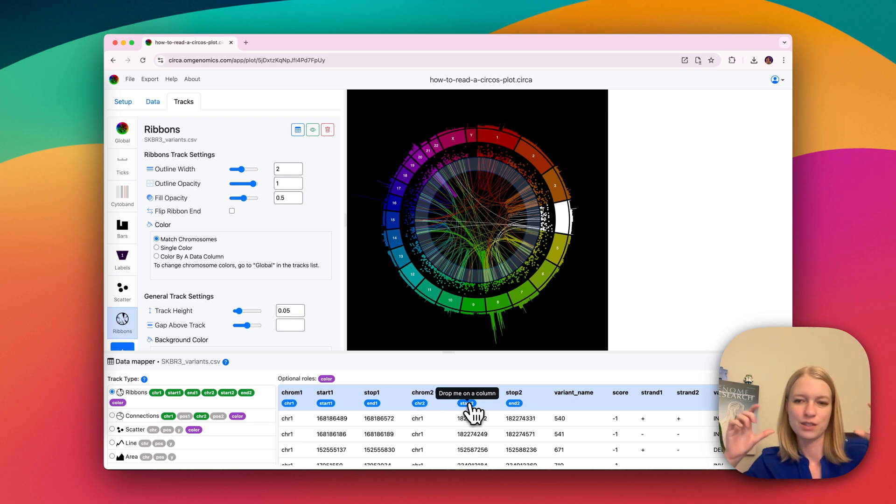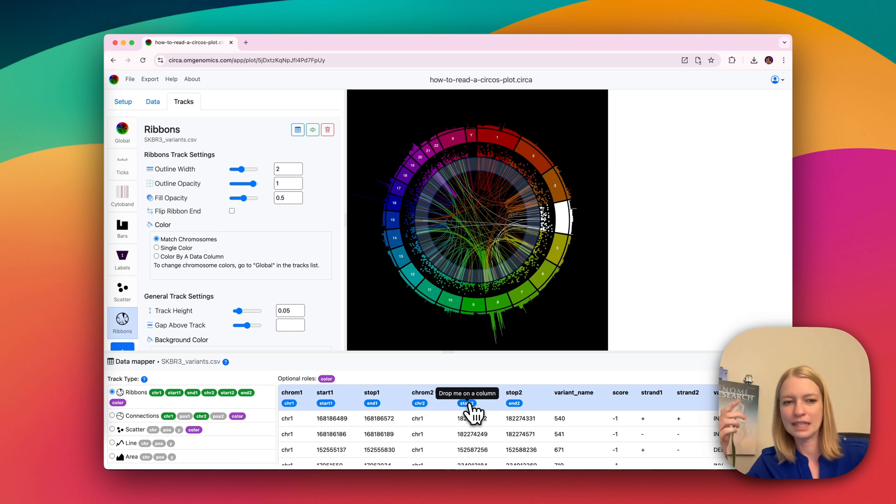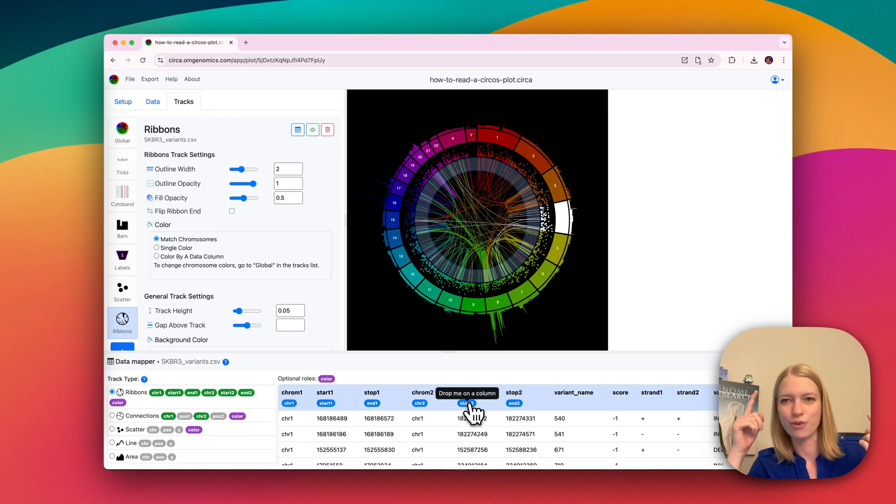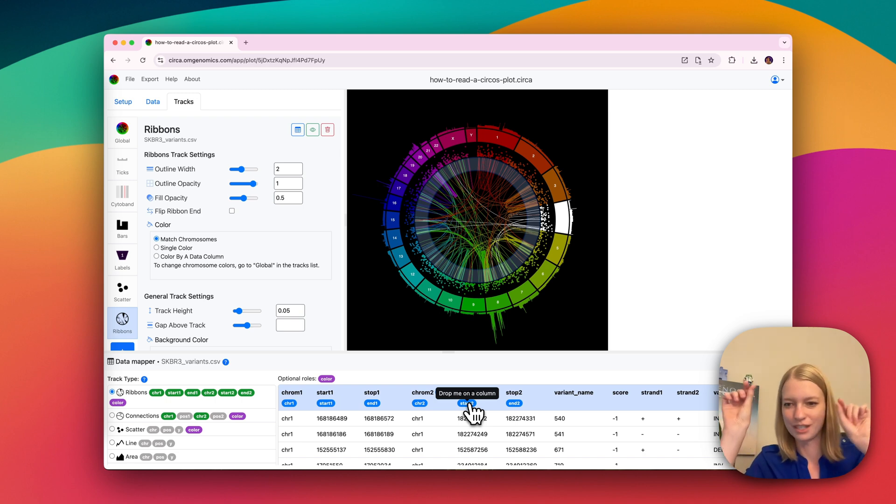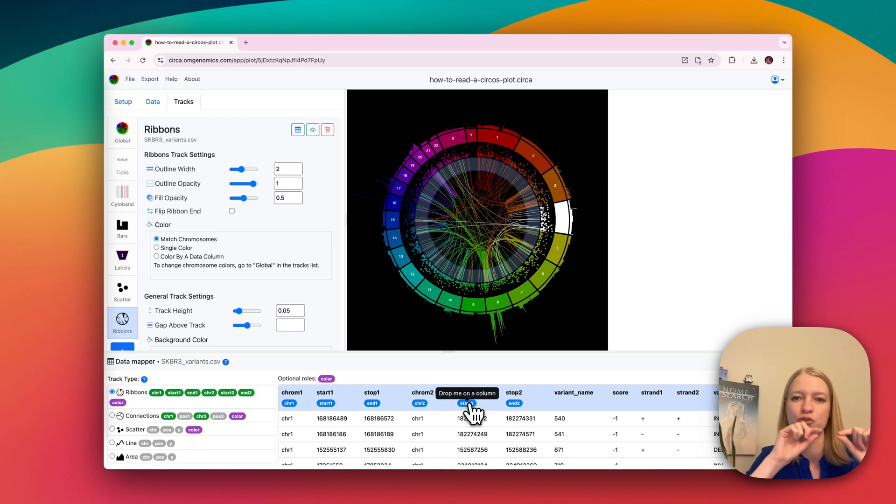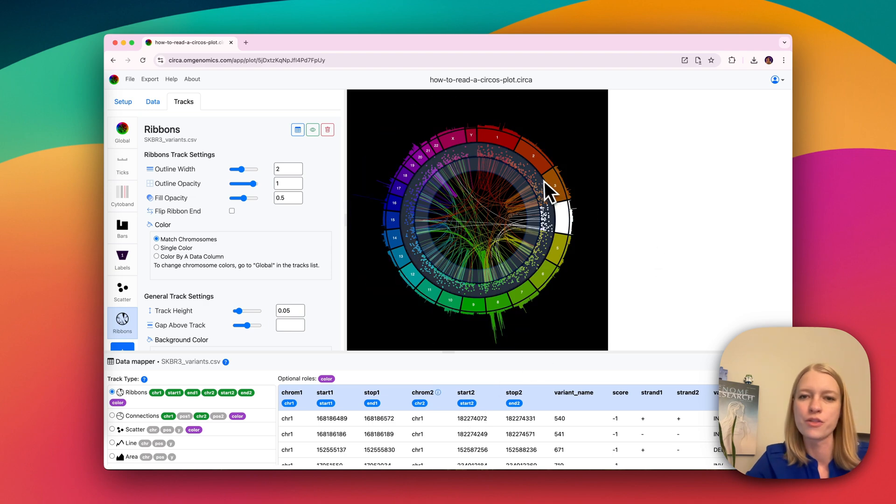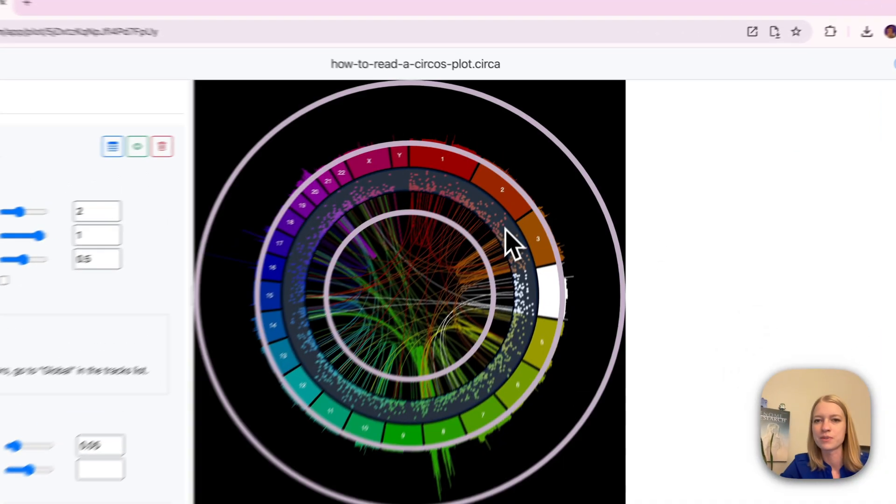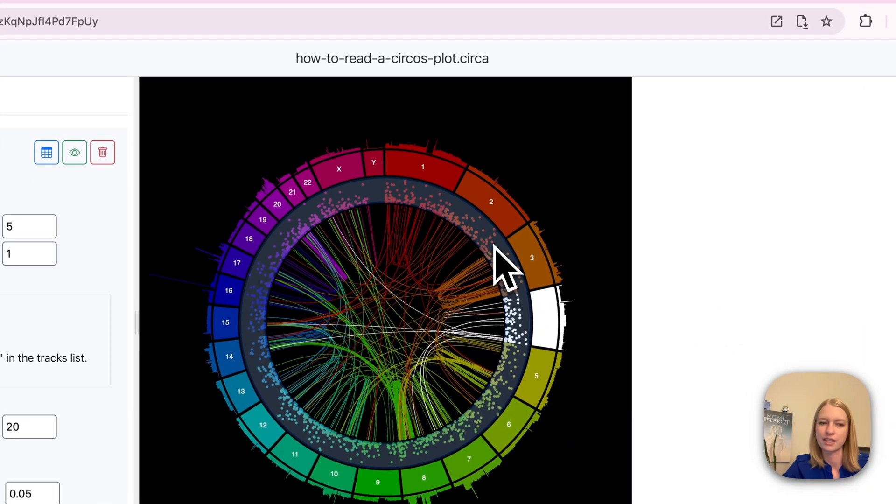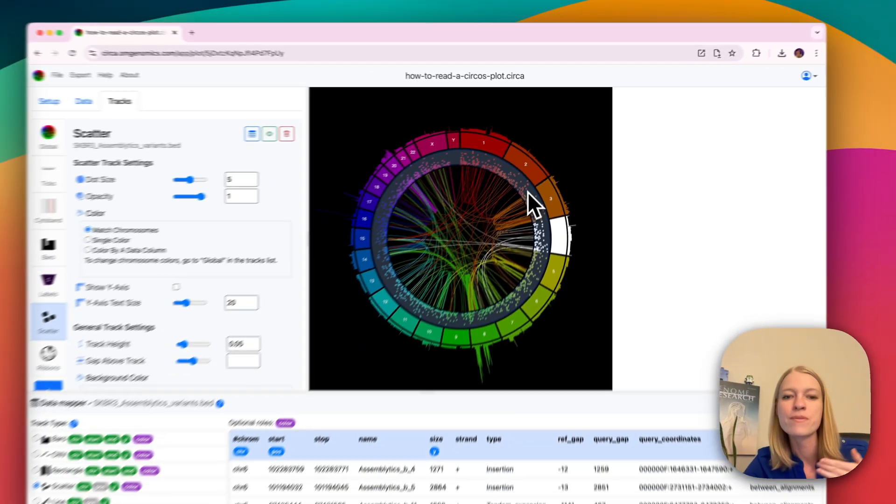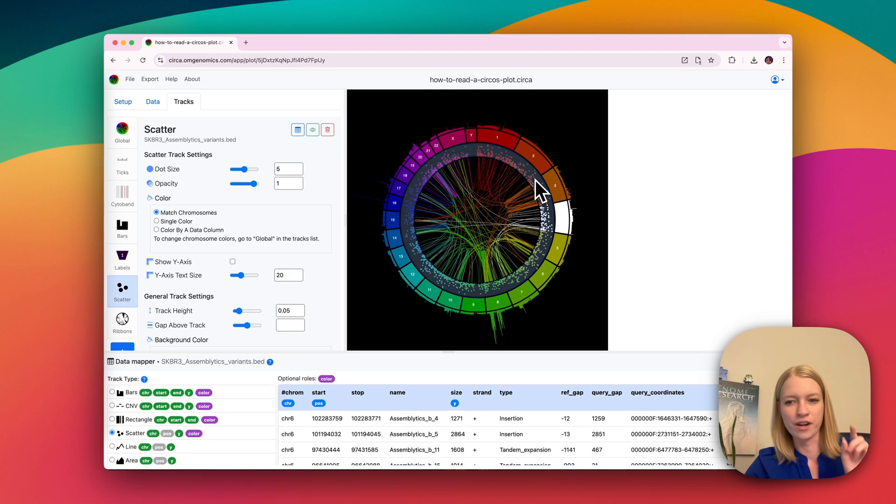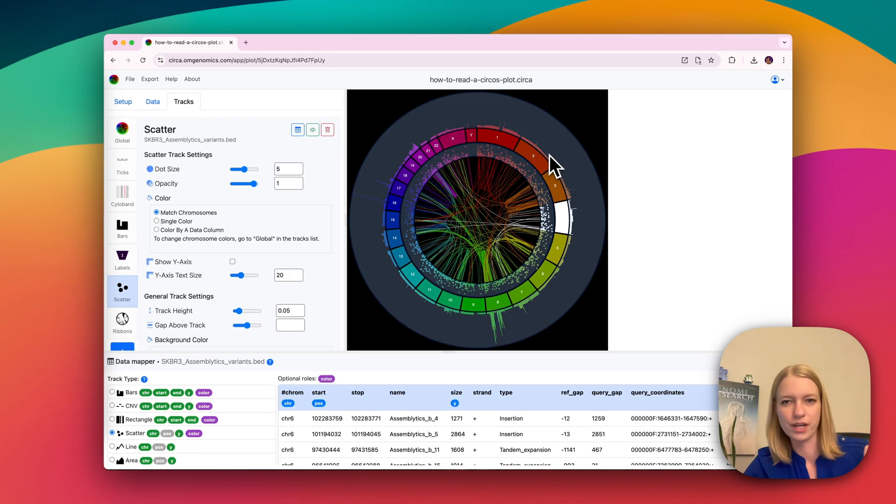And so you're basically going to be drawing connections. So if you think about it, it makes sense that you would need to have two different chromosome position pairs in order to actually draw the connection between two different chromosomes, while some other data types like our scatterplot we showed before is only going to contain one chromosome position point.